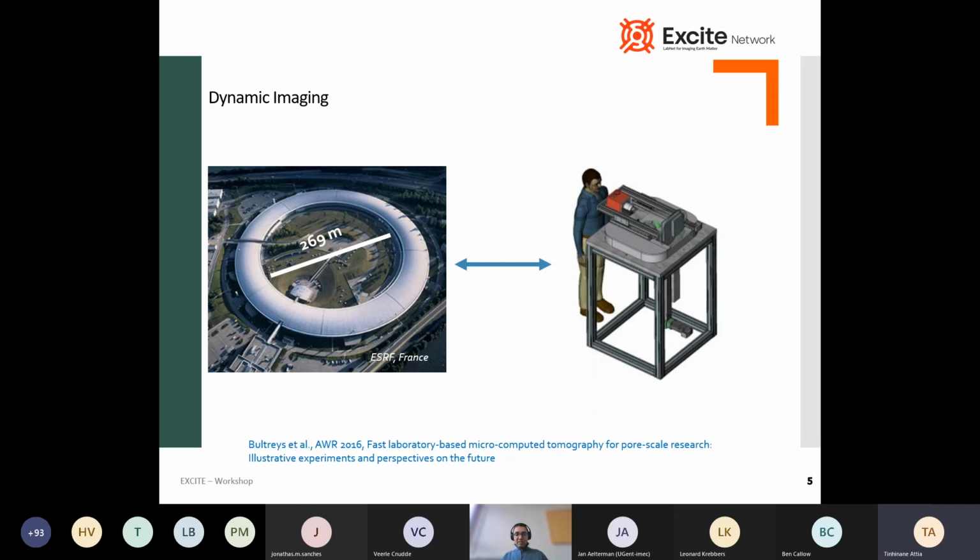And as the name suggests, the scanning and acquisition is continuous and non-stop, for a period of time. This gives us the possibility to do the reconstructions in a flexible way, not only being limited between 0 and 360 degrees, but every 360-degree sequence can be full data for us to do the reconstruction and study our samples.